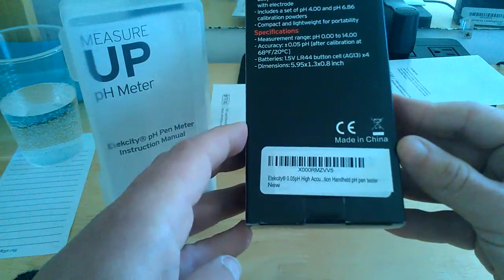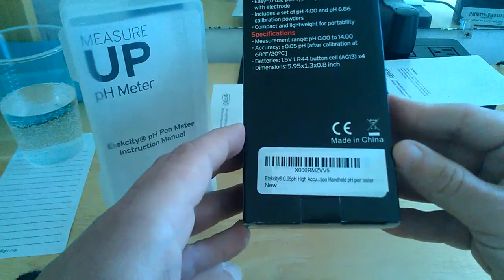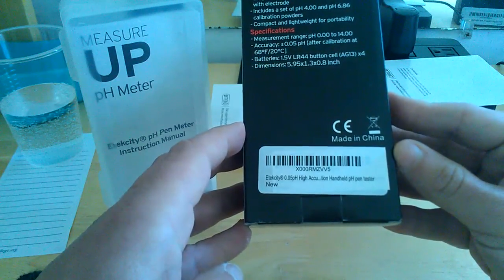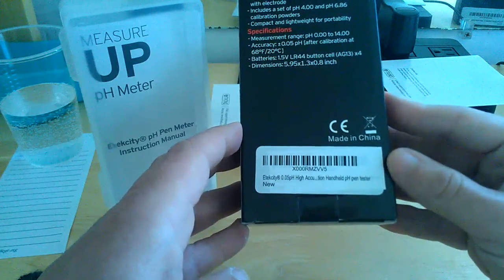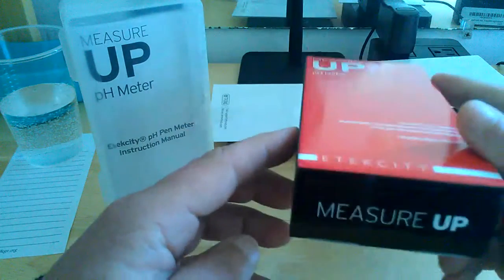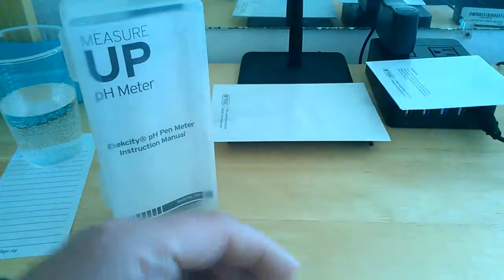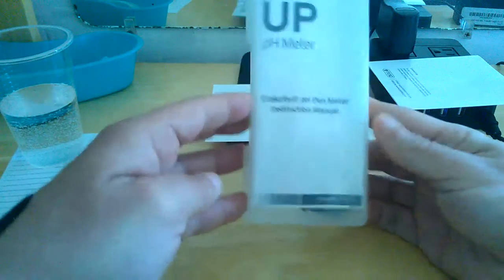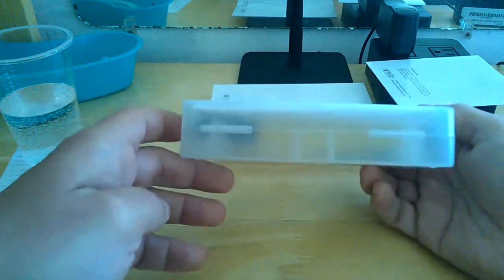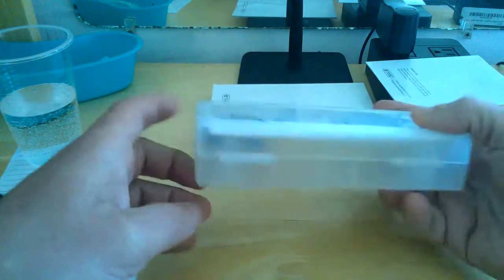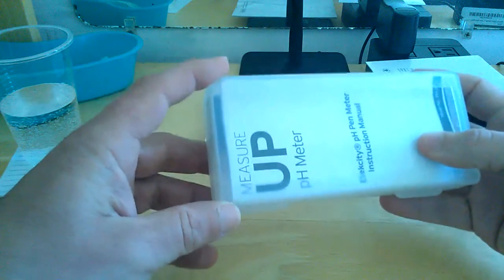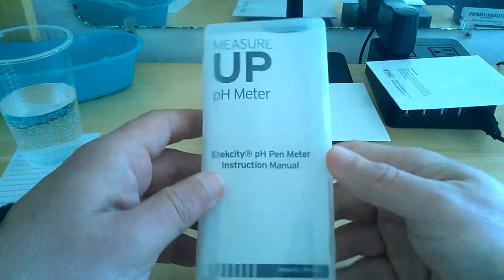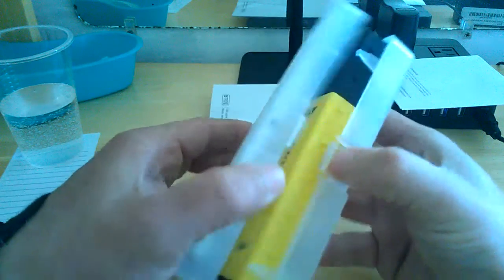As you can see there, it's the ETEC City 0.05 pH high accuracy handheld pH pen tester. That's about it on the box. This is the product here itself. Comes in this very handy case. It's only about a 6 inch long case or so, about an inch and a half thick by about 2.5 this way. It's the measure up line. Really nice storage case.